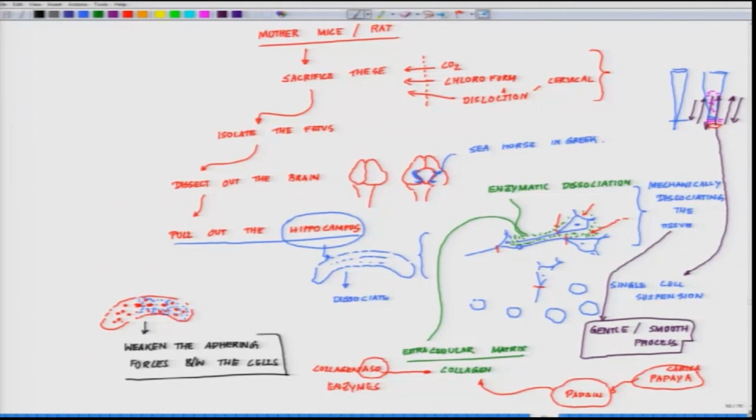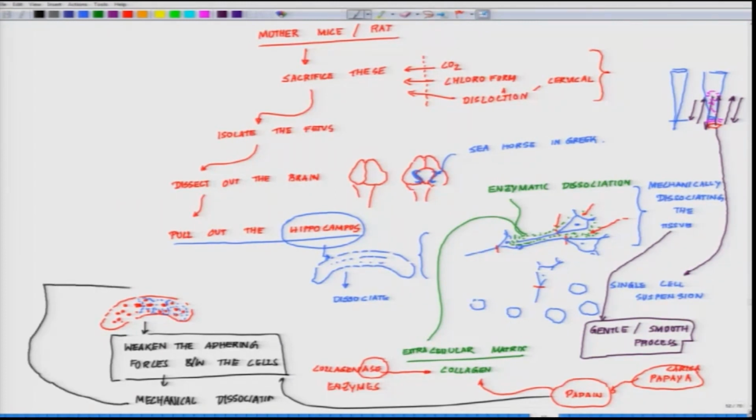This is what it does, and followed by this treatment, if you offer a mechanical shearing or mechanical dissociation, what you obtain is again the same thing we talked about here, a single cell suspension.